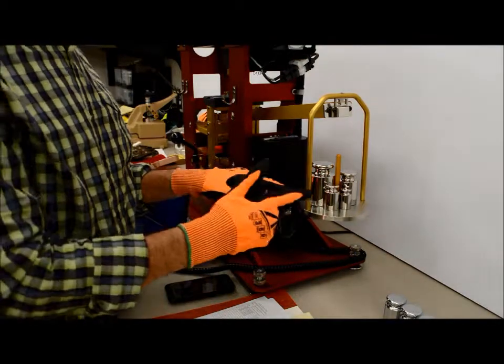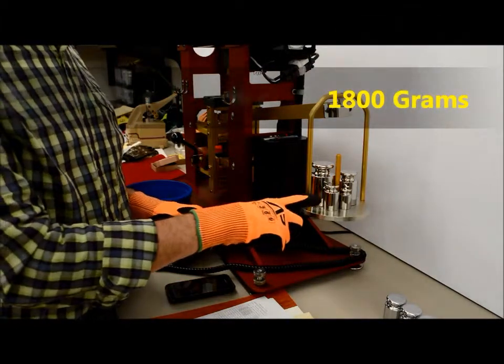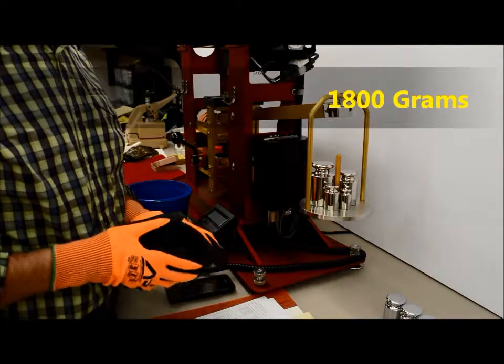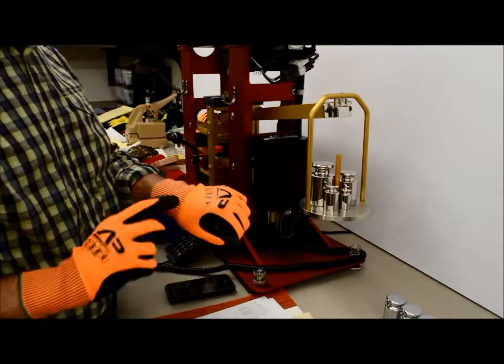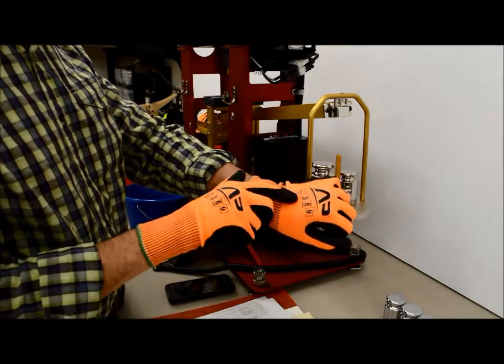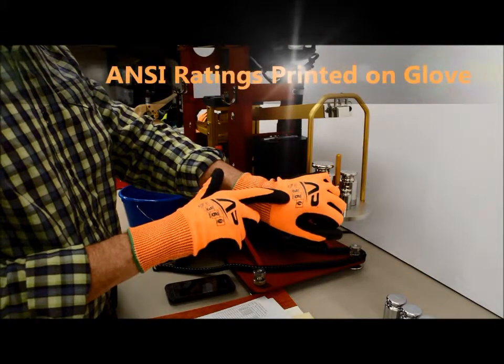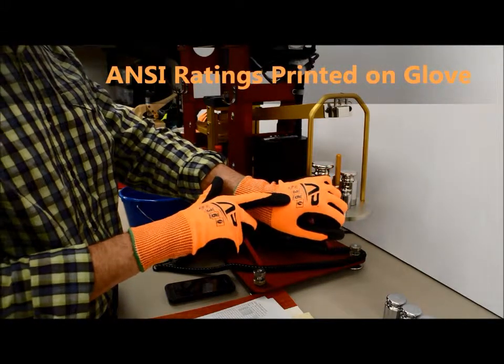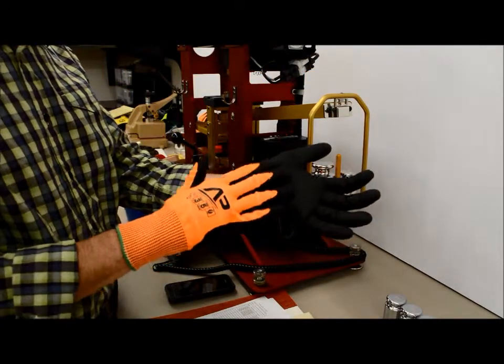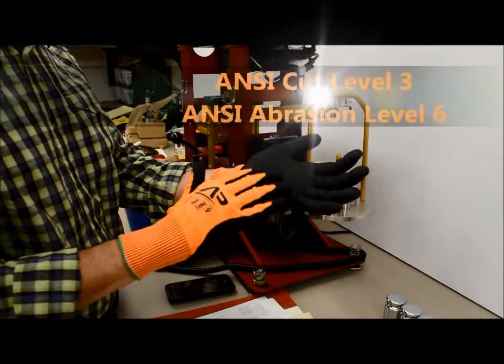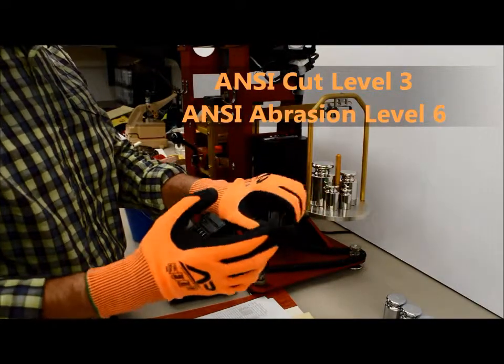If you'll look, we want to emphasize that we are using 1,800 grams of weight in this test from our precision weight collection. And we anticipate this glove will be an ANSI cut level 3. So you see the gloves labeled ANSI cut level 3, and the abrasion level is listed as ANSI abrasion level 6, which is the highest rating. So that's where we test the palm in the abrasion test to see how many cycles it lasts until the hole is worn in the glove.